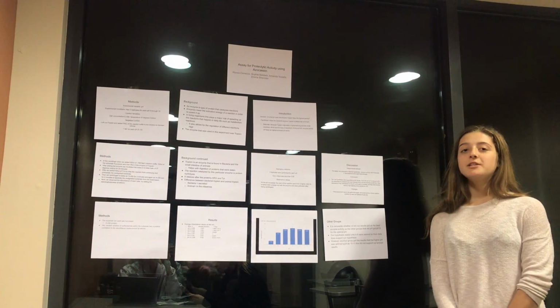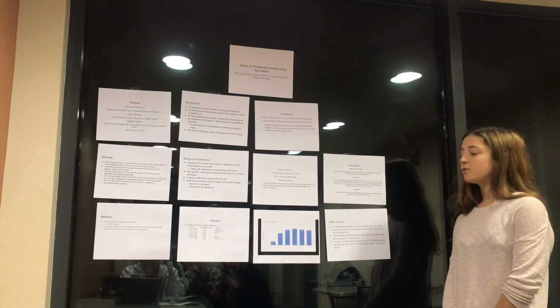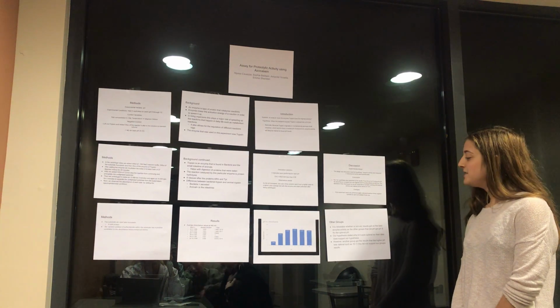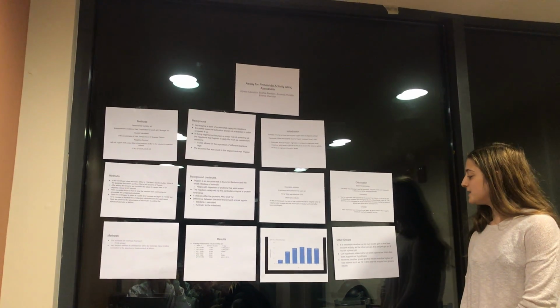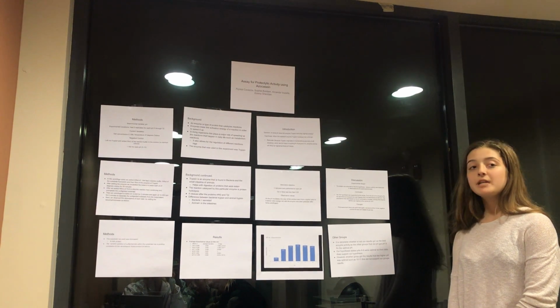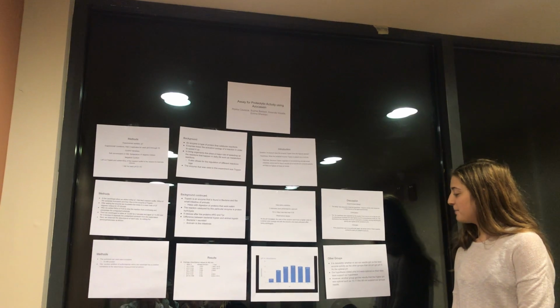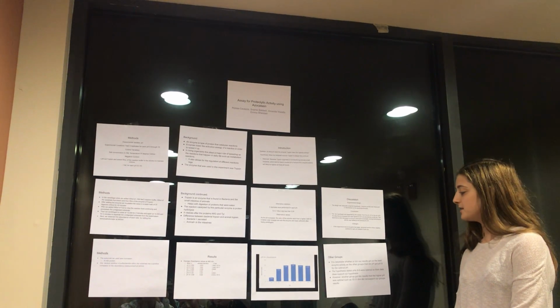If we were to add any changes to this experiment, and we were to perform it again, we would perform 3 negative controls for each pH instead of just 1. It is debatable whether or not our results got us the best enzyme activity, as the other groups that did pH got pH 9 instead of 8 for the optimal. Our hypothesis stated that pHs 8 to 9 were optimal, so their data does support our hypothesis.